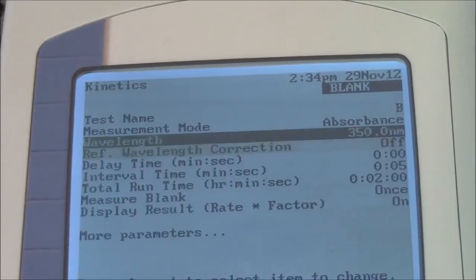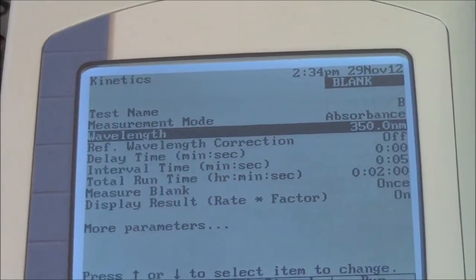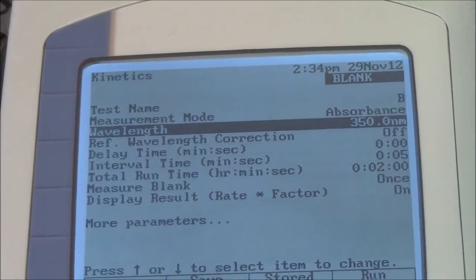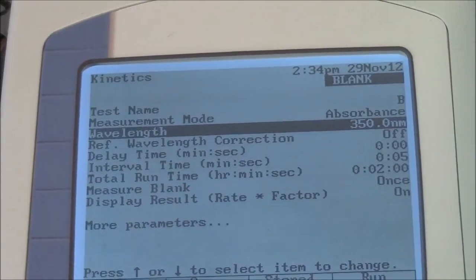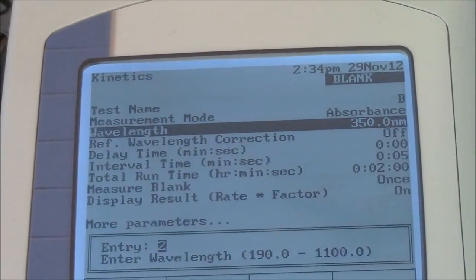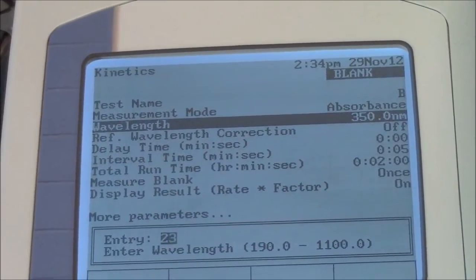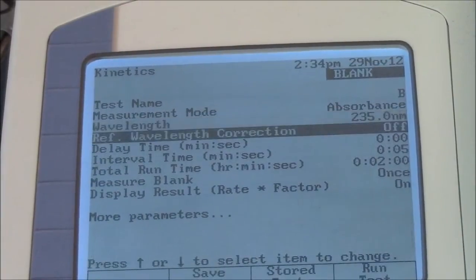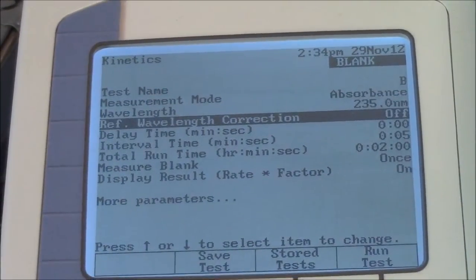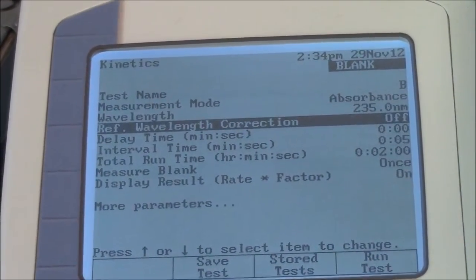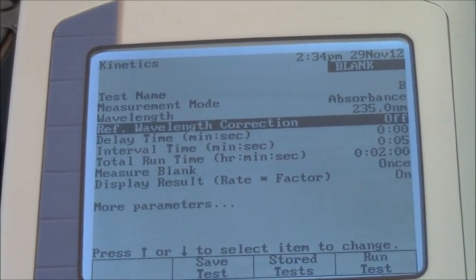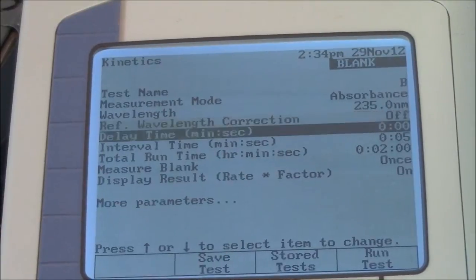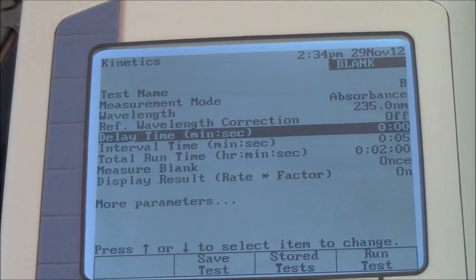I don't really want that, so I go back again. 2, 3, 5 is what I want. Reference wavelength — leave that off. Delay time — none.